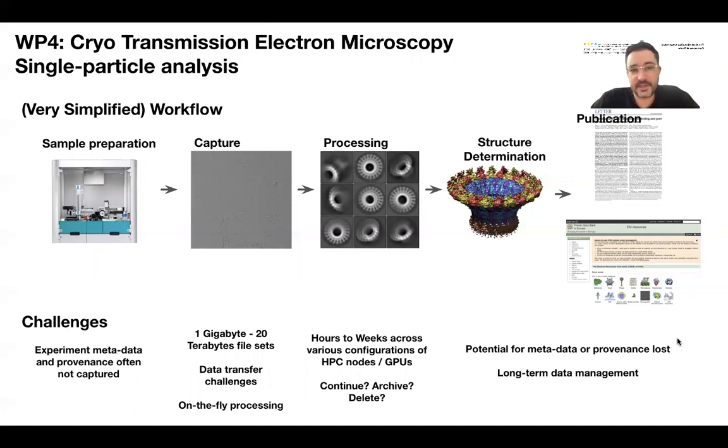obviously with regards to the science of sample preparation and the data capture as well, and the experiments that are involved. But in particular, with the informatics side, some of the challenges here that we experience are the capture of metadata at the experiment, the sheer scale and size of the data sets that are required to gain good samples. We sometimes deal with 5, 10, 20 terabyte data sets. The amount of processing that's involved with regards to these sort of techniques is quite significant, despite the fact that it accelerates very well on GPUs.